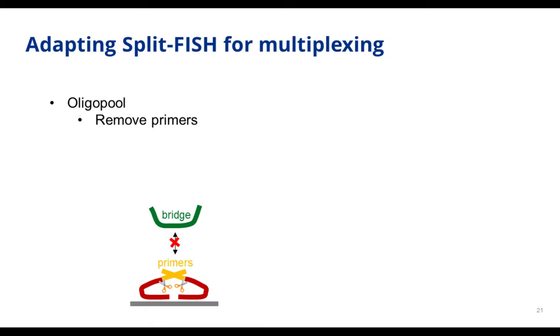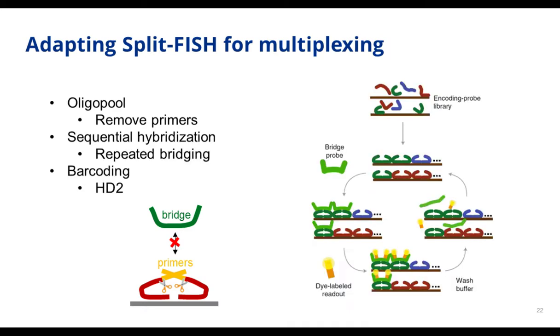So we did more optimization to adapt it to oligo pool so that it can be in a big pool of 100,000 sequences.